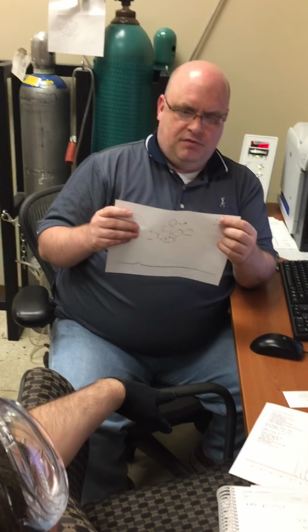All right. So that's the aromatic region. That takes care of the pyridine, and so this is the whole shebang. Now we come down. All this stuff here is garbage. Now we're going to come to this little region in here. This could have been shimmed a little better, but it'll work.